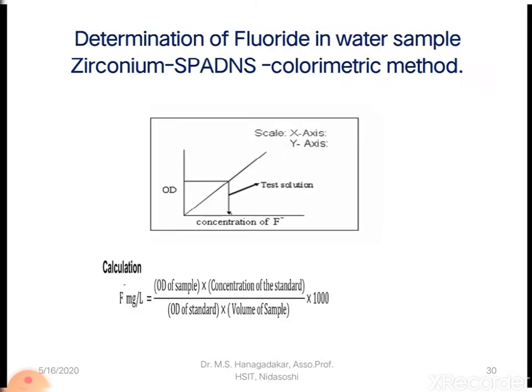So this is what we had about the estimation of fluoride in a water sample by the zirconium SPADNS reagent method.